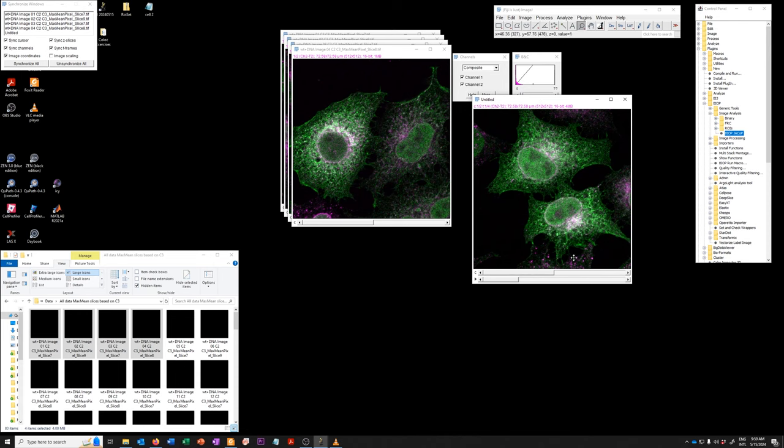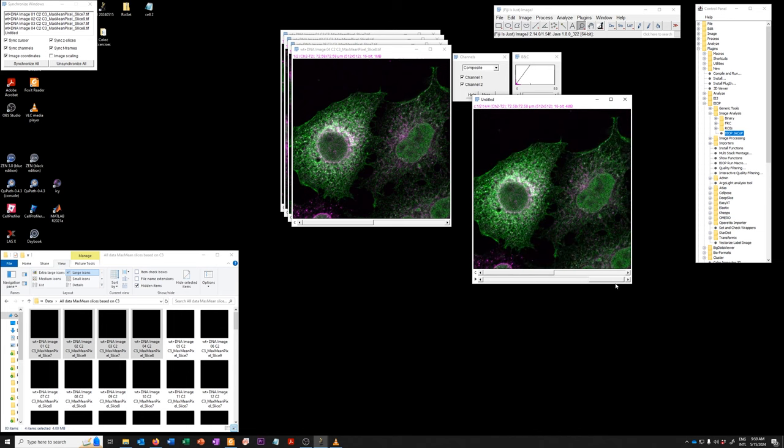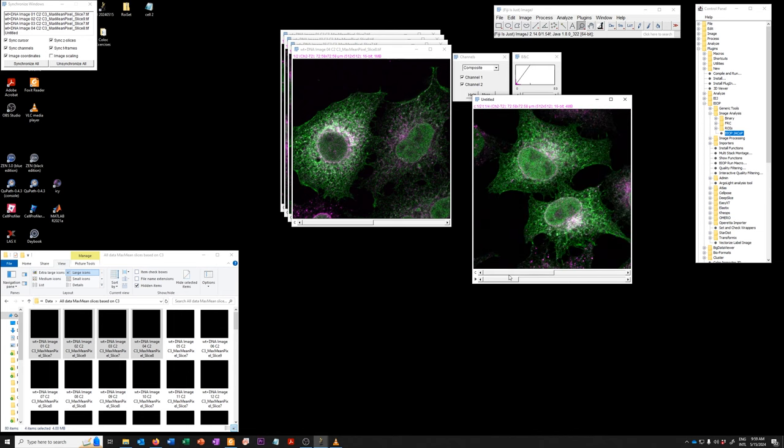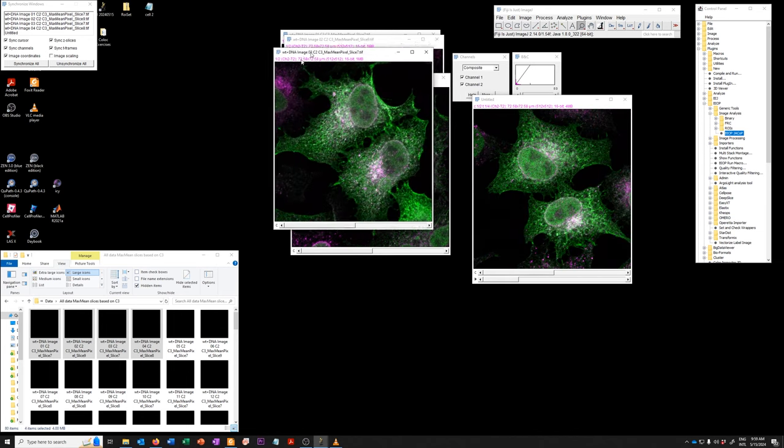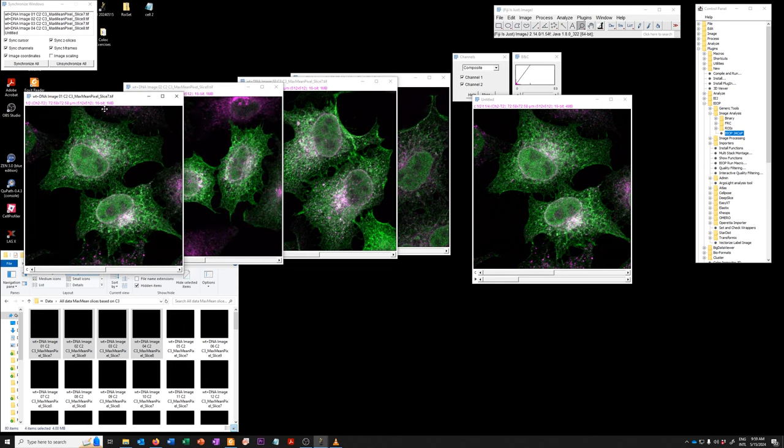Now we have two channel images. You can see there are two channels here, but we have multiple time points. So the way it created this is it put each of these images as a time point in this concatenated stack.